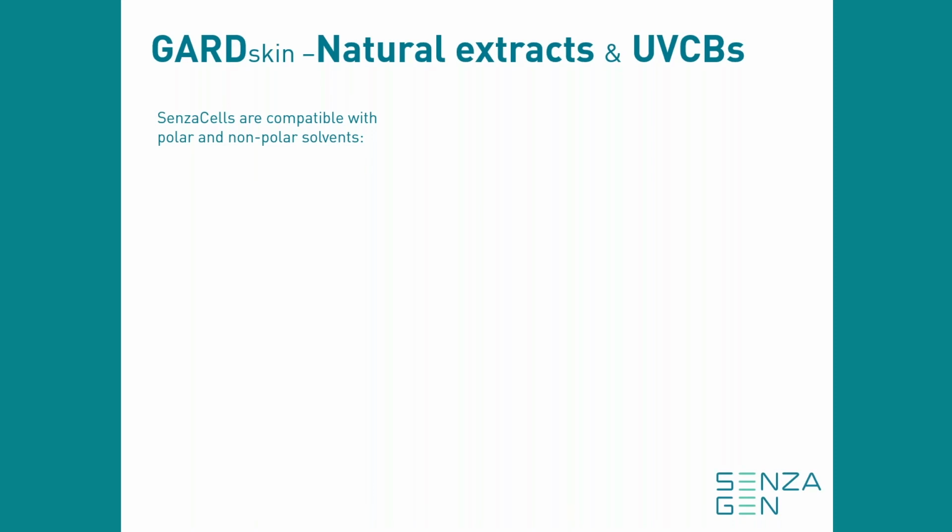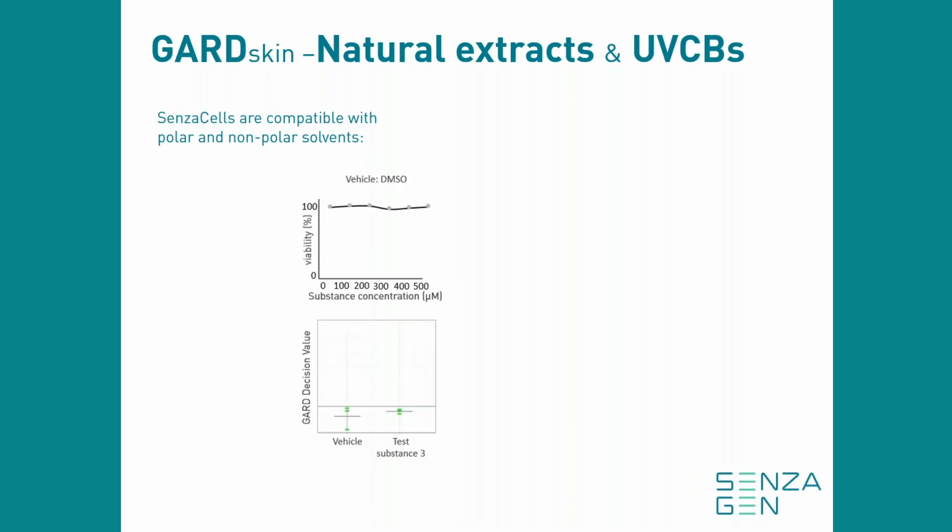This is just to show you how we did with one compound that had very, very low water solubility. We first tried to use DMSO as the solvent, but it was practically impossible to get this compound into solution. As you can see from the top figure, it was impossible to have any bioavailability of this compound, and the compound was predicted as a non-sensitizer.